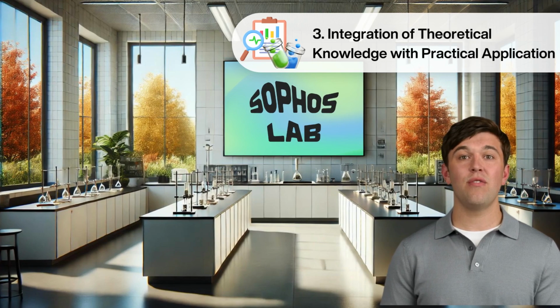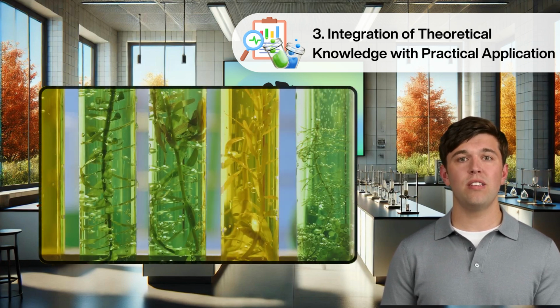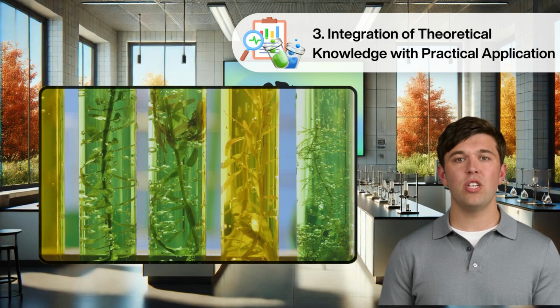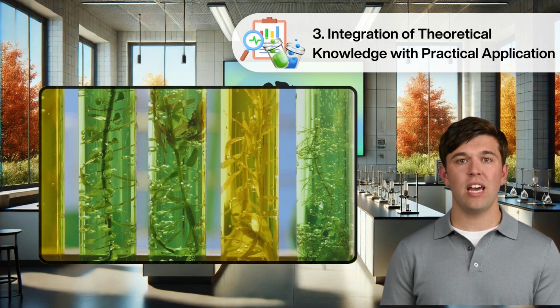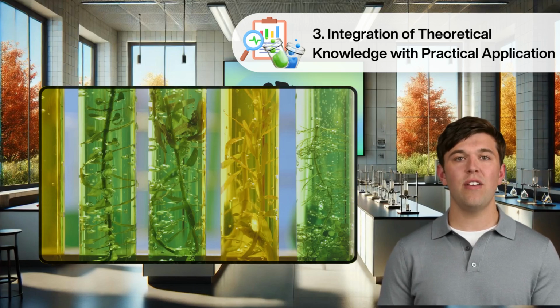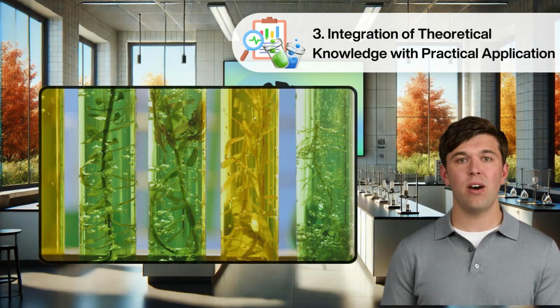This practical offers an invaluable opportunity to apply theoretical concepts from your biology curriculum in a hands-on setting. By observing the production of oxygen bubbles in an aquatic plant, the abstract process of photosynthesis becomes concrete and easier to comprehend. This integration of theory with practice bridges the gap between what you learn in textbooks and real-world biological processes. Let's dive in and explore how light intensity impacts the rate of photosynthesis in plants.